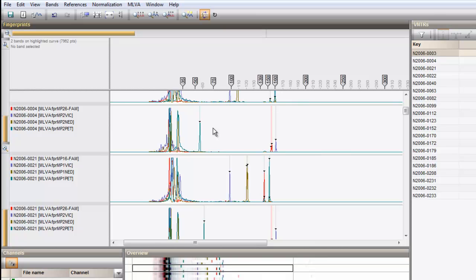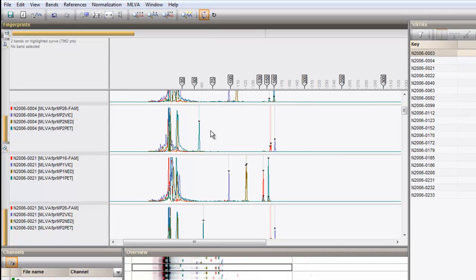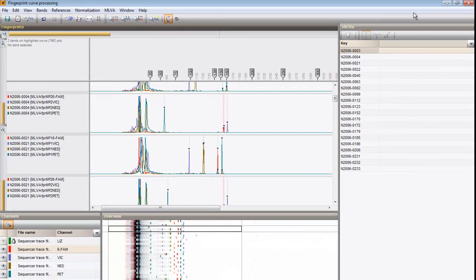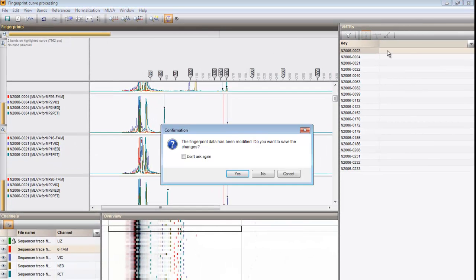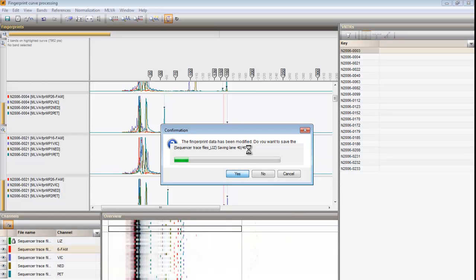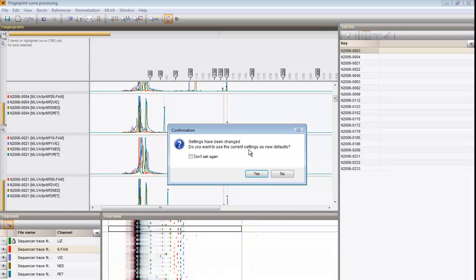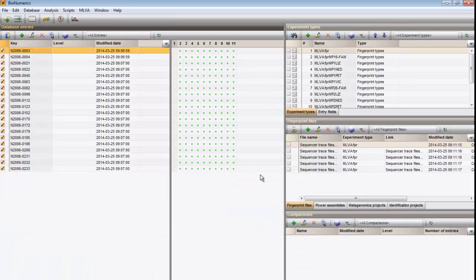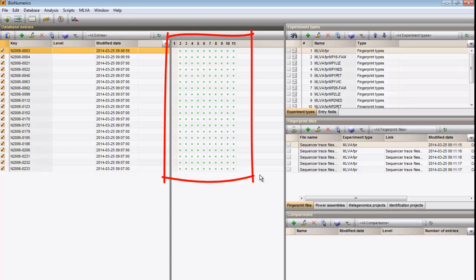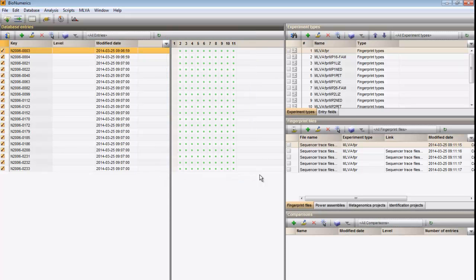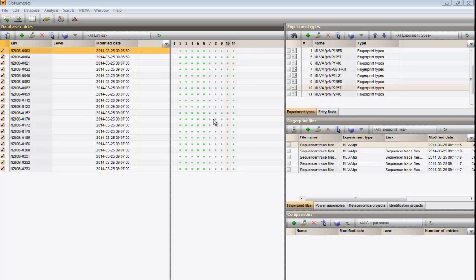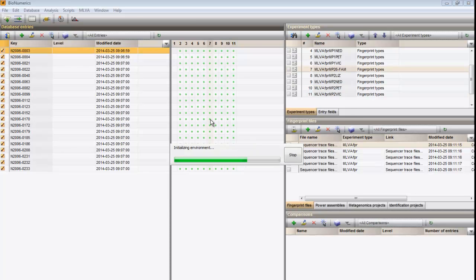All the VNTR bands of interest were found. Now we can close the fingerprint curve processing window. In the main window, we see that all entries now have experimental data for all newly created fingerprint types. Clicking on a colored dot will open the respective curve window.